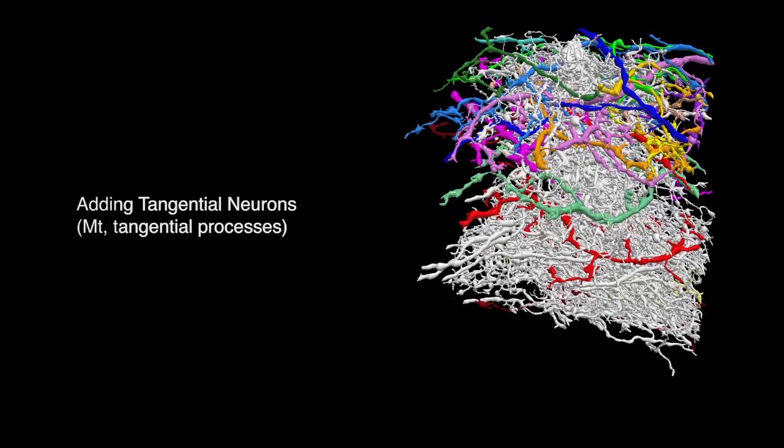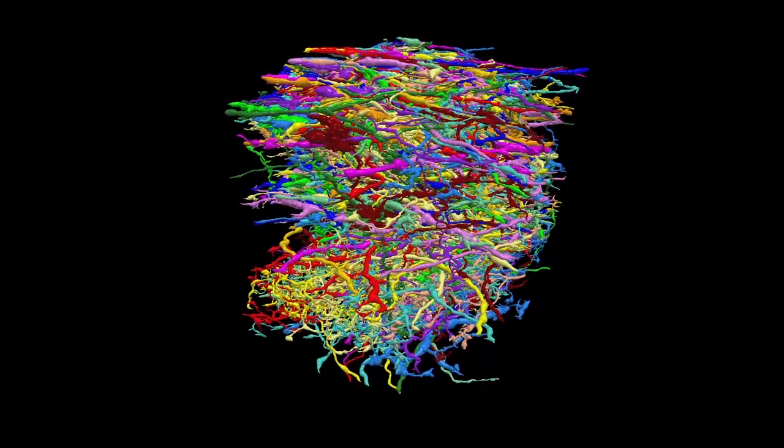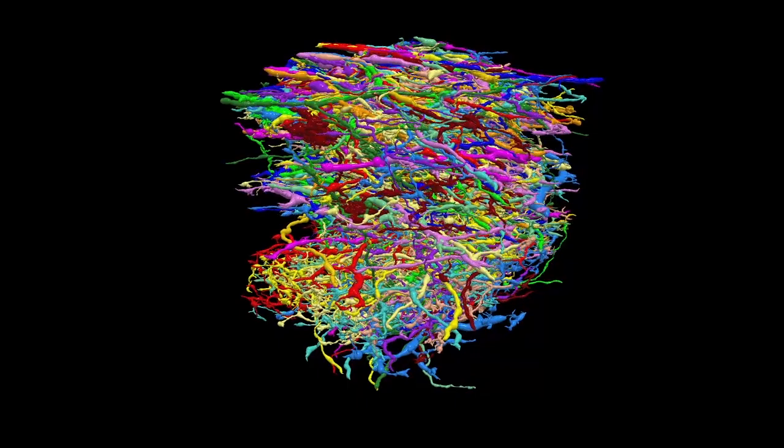The process of creating a connectome is not only labor-intensive, but also demands a high level of technical precision. Even a very small error in a single section may propagate across many thousands of sections and then compromise the quality of the reconstruction.